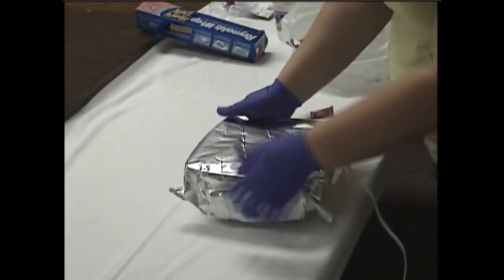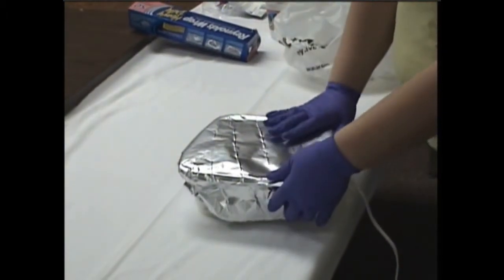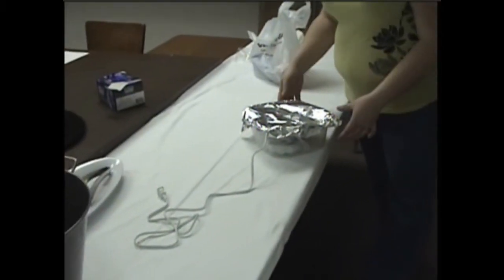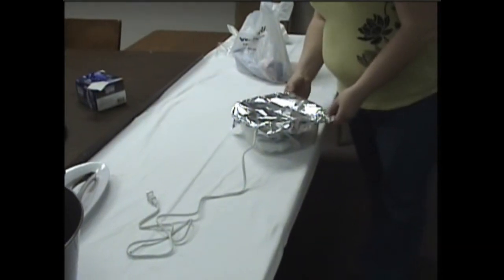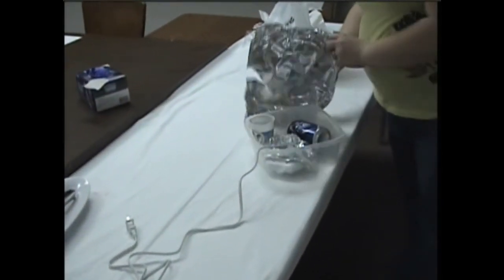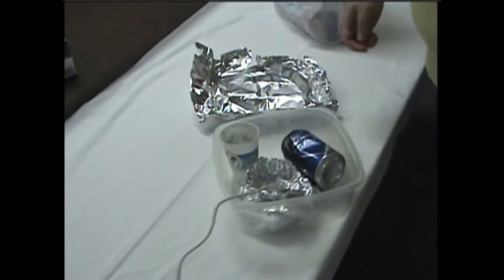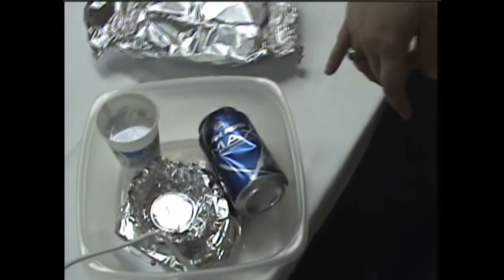Superglue fuming usually takes about 10 to 15 minutes to develop a print. After 15 minutes, we remove the lid from the chamber and see that our fingerprint has developed. You can see the ridge details in the print.